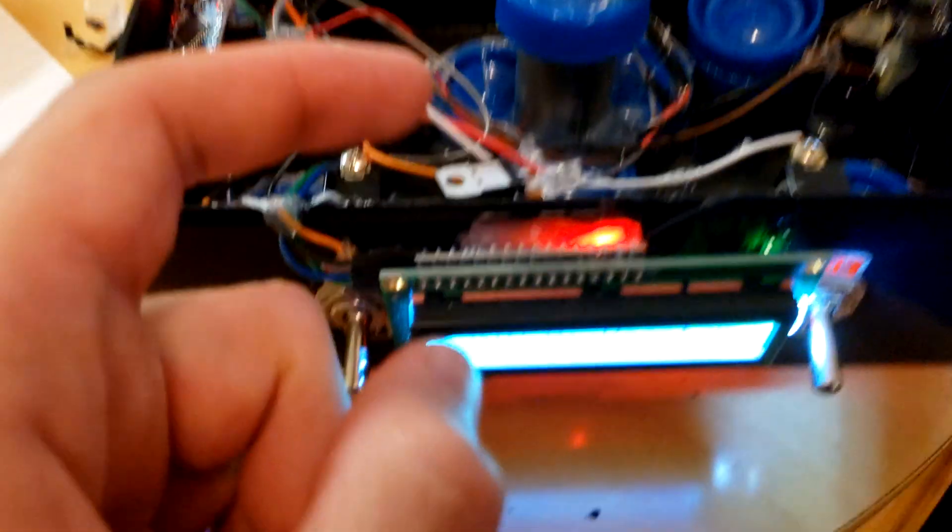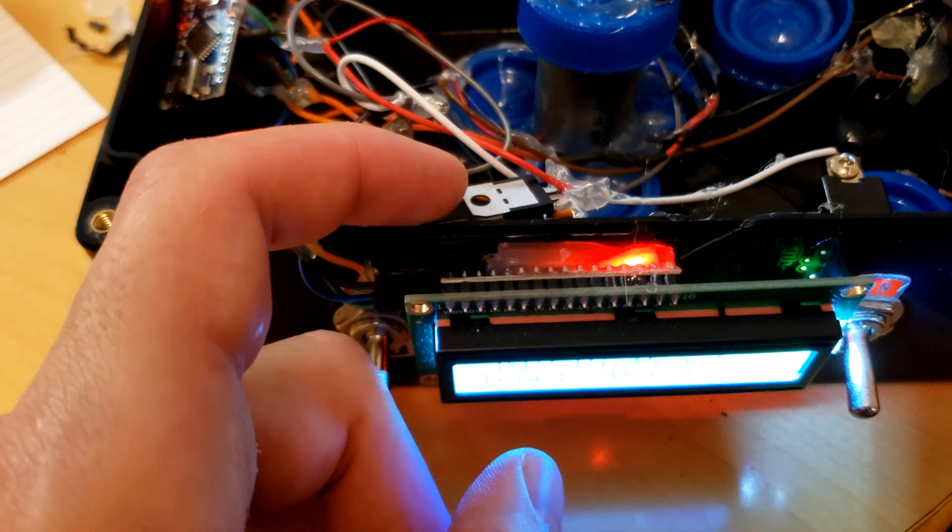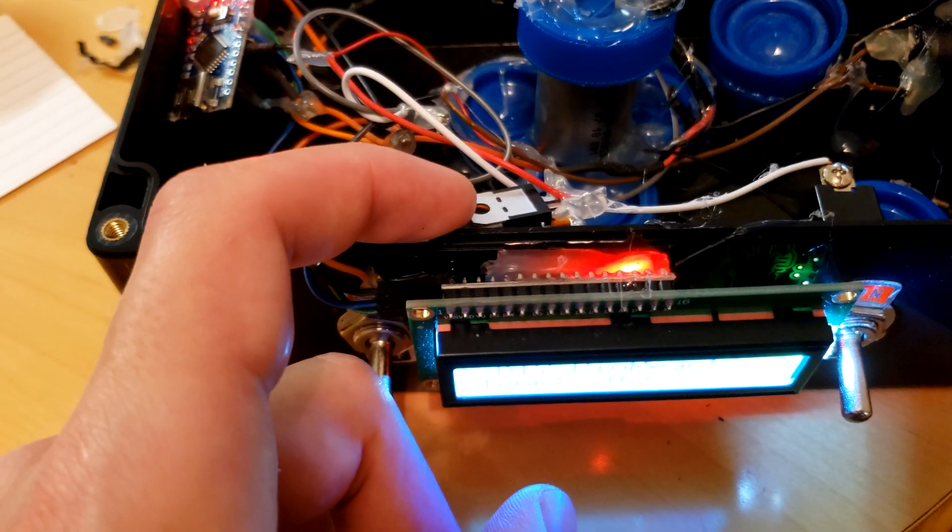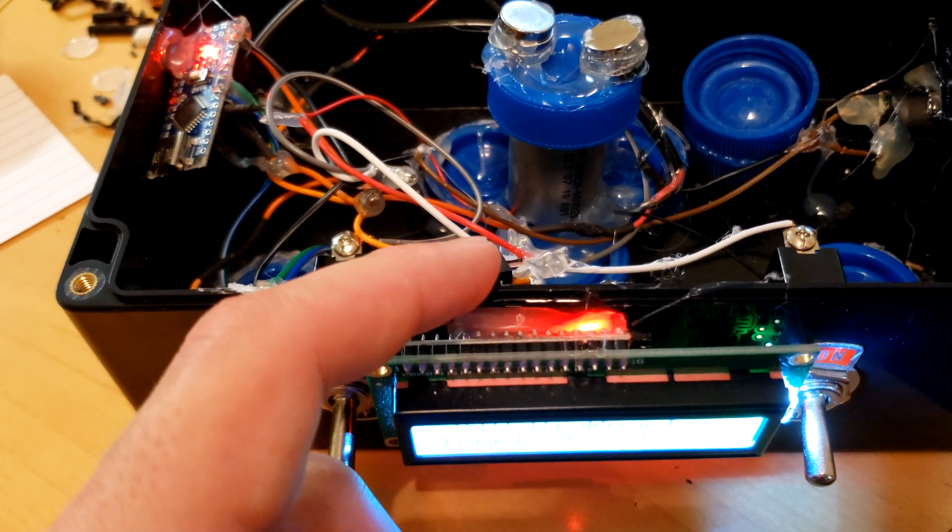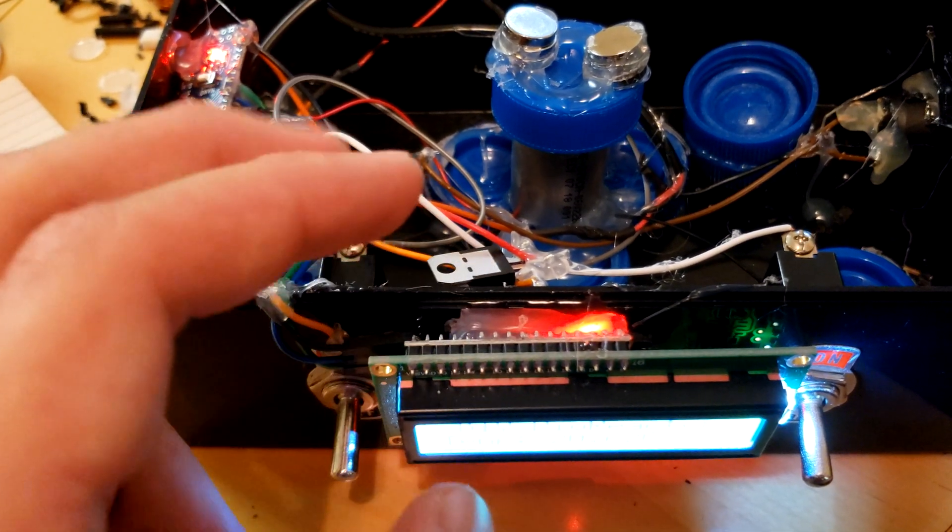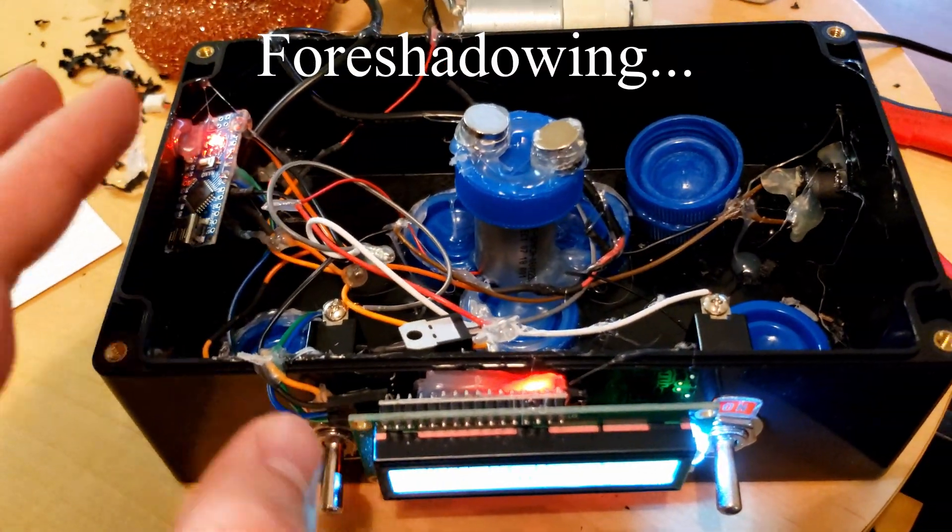So the secret to slow the motor down was using this voltage regulator right here. So this is a 3 volt voltage regulator. It's an LD33V. Usually when you use 5 volt voltage regulators, you have some capacitors between the legs. But in this case, I guess I didn't need them. All of the circuits I saw online, you didn't need them, so I didn't use one.